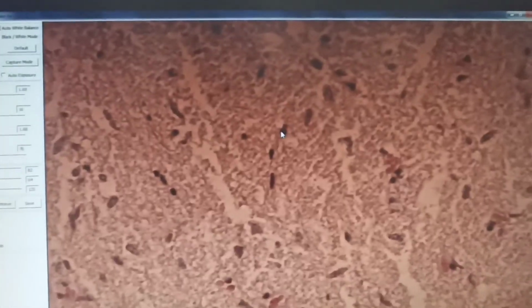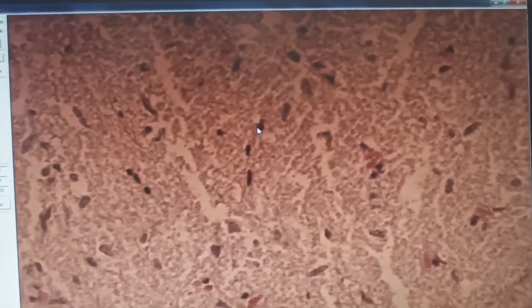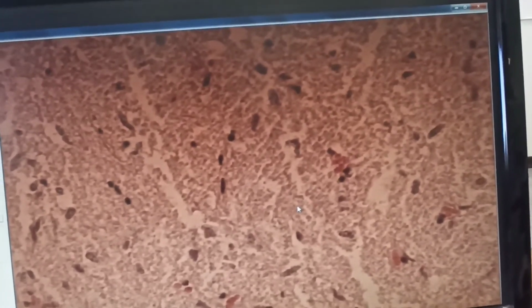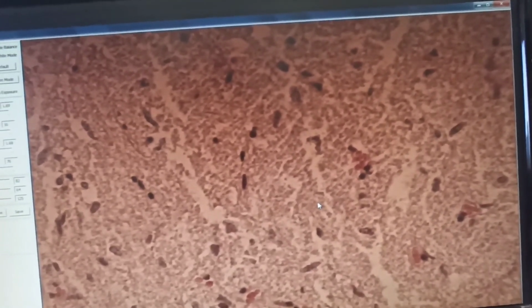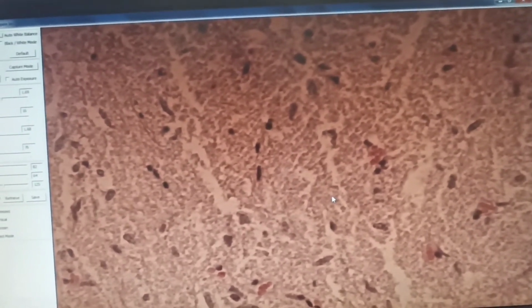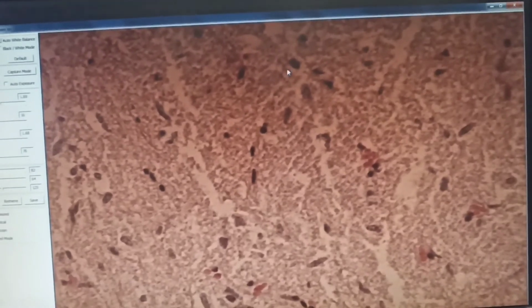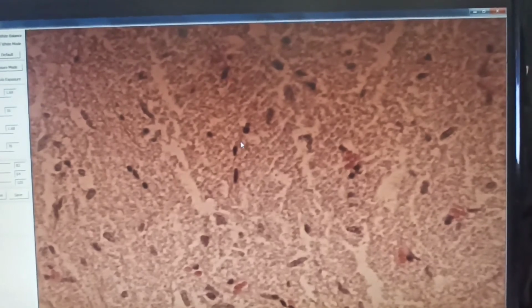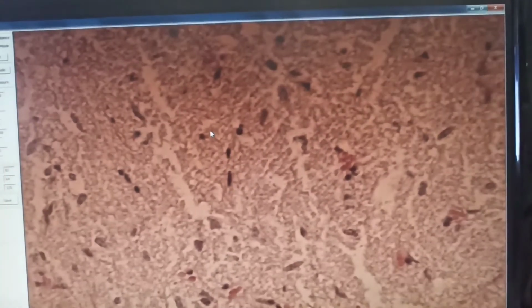The intermediate part of adenohypophysis is located near the Rathke's pouch, next to pituicyte cells, and these are related to axons. As I said, there are a lot of sections from the axon because it is a long line. So it is clear that we have a lot of sections of axon here, and these are the nuclei of pituicyte cells. Okay, fine.